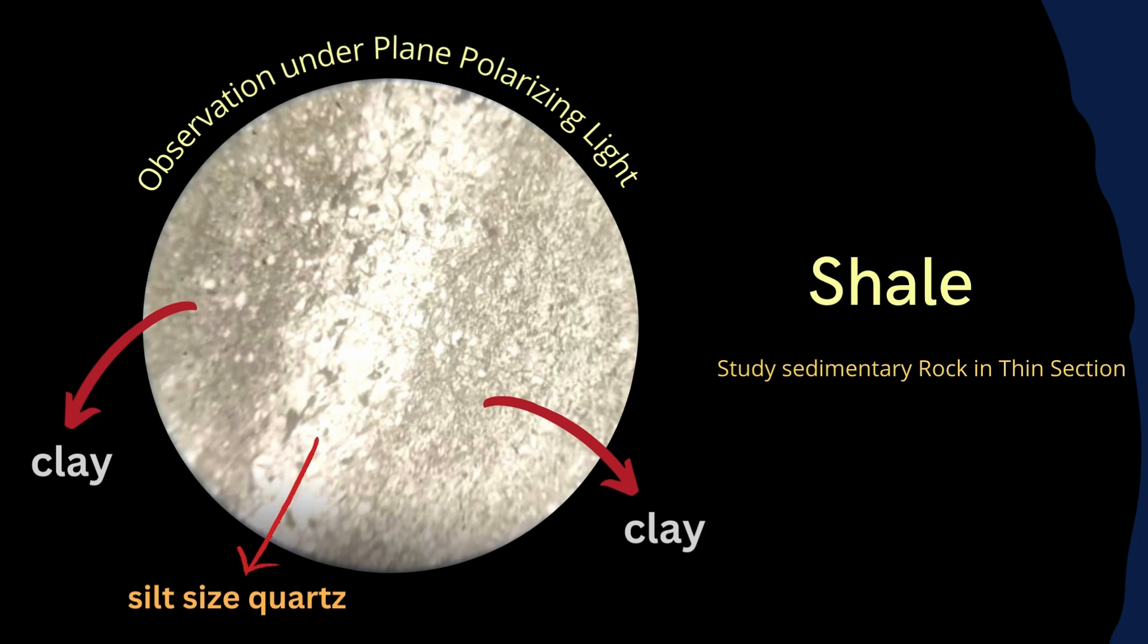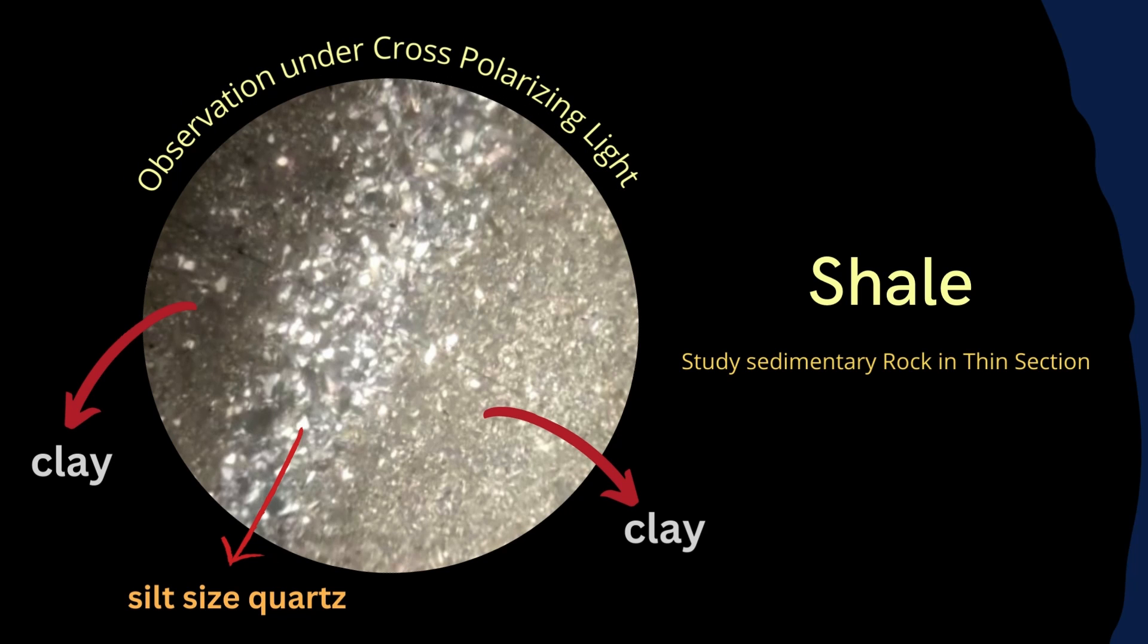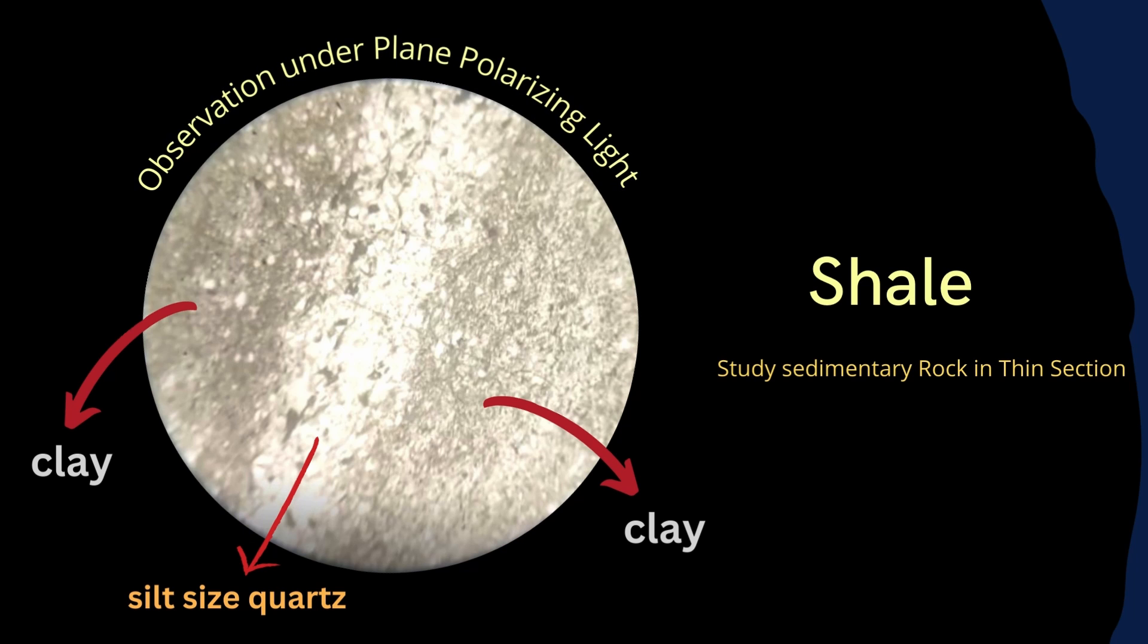Here you can see there is alternating color. The middle streak is built of silt size quartz and the other sides are clay. This is the plain polarized view and this is the view of shale in thin section under the crossed polars. You can also observe the alternating nature of clay and silt size quartz.